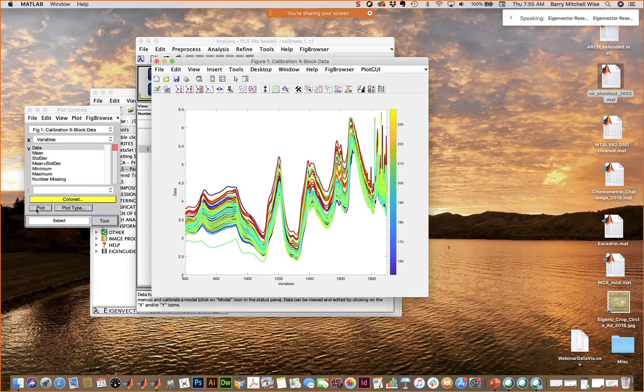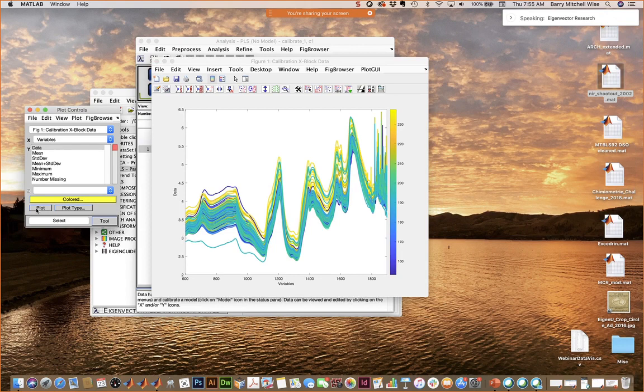assigning class information for large data sets. Okay, well, there's a couple of ways that you can do that. One is if it's already clustered, you can select samples and then set classes graphically of big groups of samples.